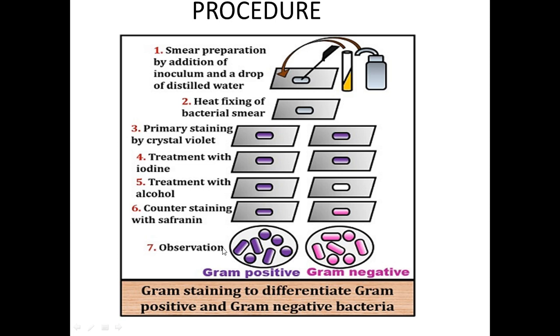That explains why, after observation, we are going to see gram-positive bacteria occurring violet under the microscope, but gram-negative will occur safranin. A gram-positive is violet because it has a very thick peptidoglycan cell wall which takes up the violet color of the crystal violet. Hence, even after decolorization, it can't wash it off, so it will still maintain the violet color of the crystal violet.